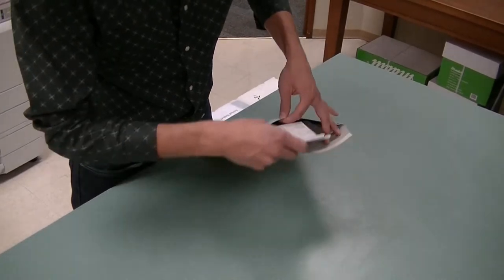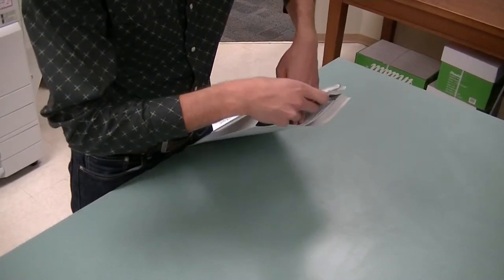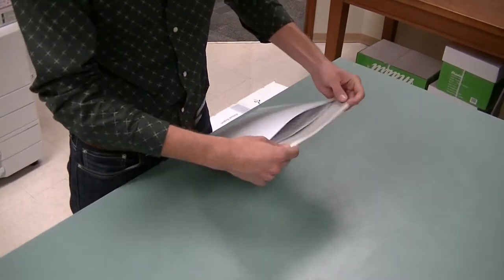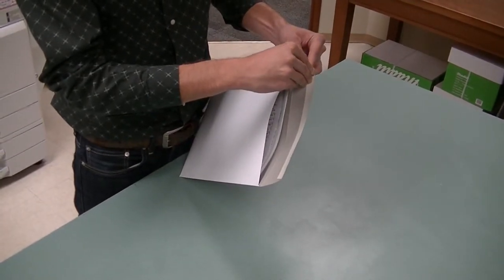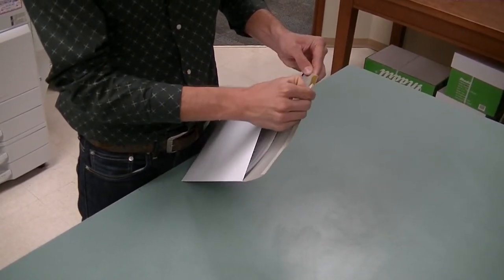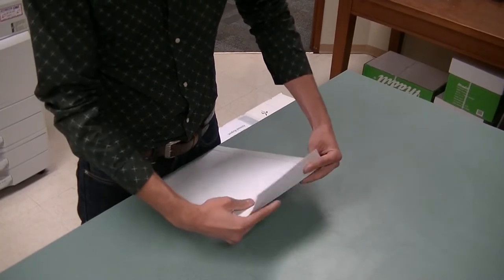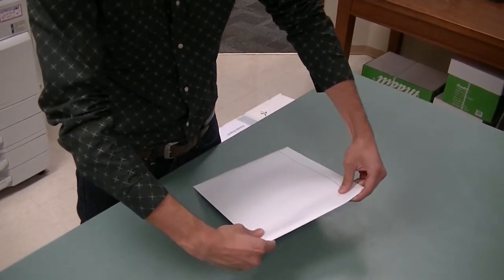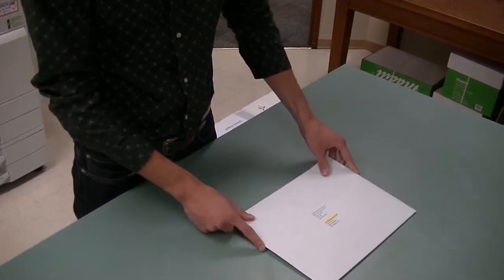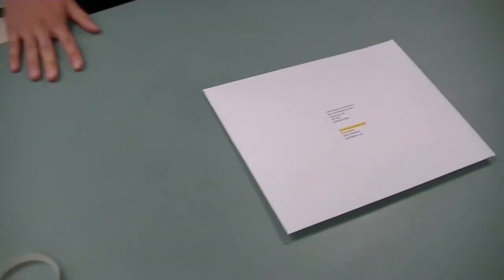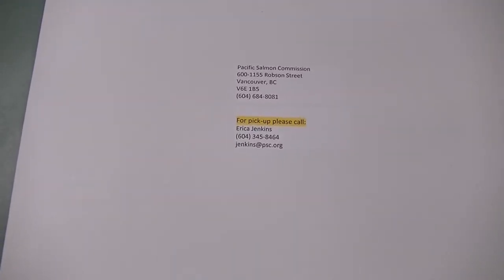Wattman sheets need to be shipped within rigid cardboard envelopes, also called stay-flats, to keep them from bending and getting damaged. Place the covered Wattman sheet in the envelope along with the scale books and any other data sheets, again making sure that all forms have been filled out. Seal the envelope, and the samples are now ready to be shipped. Envelopes should be addressed to the downtown office of the Pacific Salmon Commission, unless otherwise directed.